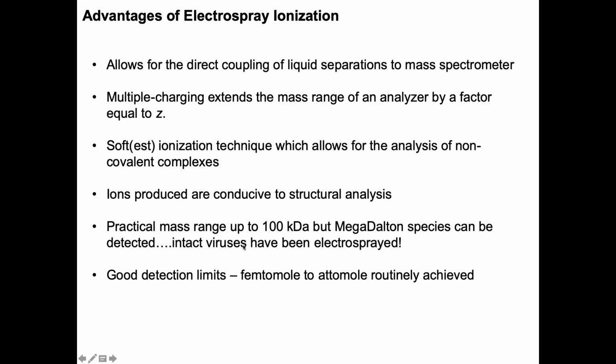Practical mass range. I don't know what I would tell you as far as an upper limit of what you can analyze, because people continue to push these boundaries. It seems like constantly people are looking at these massive protein complexes now, structural information. There's a woman at Oxford named Carol Robinson.